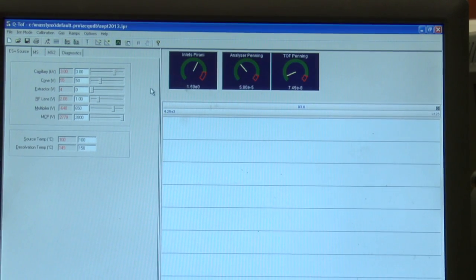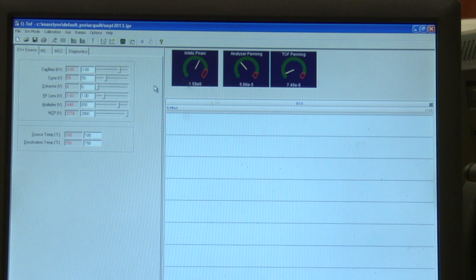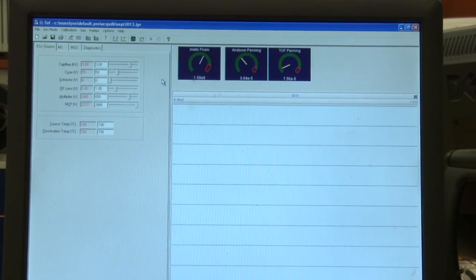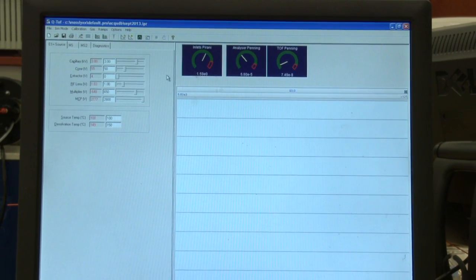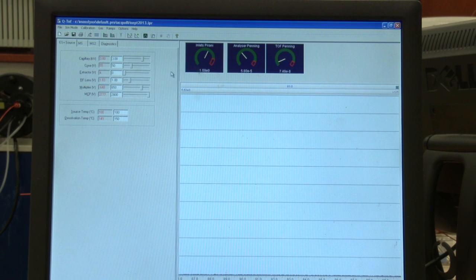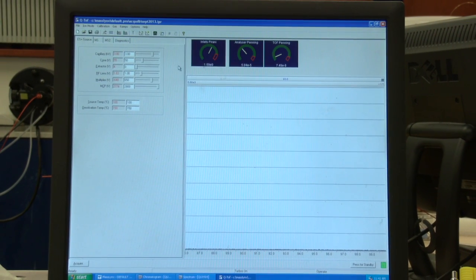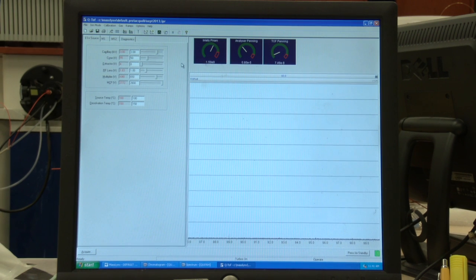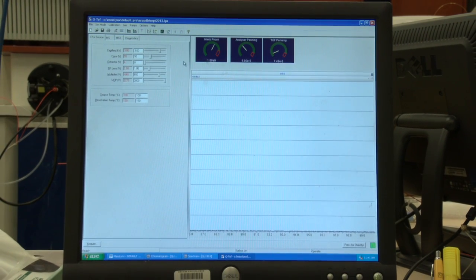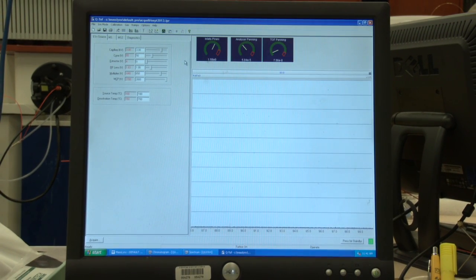Each manufacturer has their own brand of software for each instrument. Here you can see the voltages associated with the source, the detector voltages, and the source temperature controls. Adjusting the source voltages and temperatures, and also adjusting gas pressures, are all parameters that will need to be optimized to produce the best ionizing conditions for individual molecules.